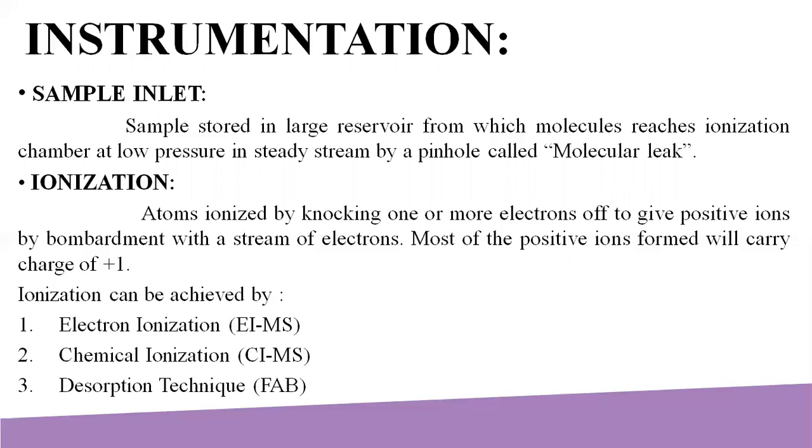The initial sample may be solid, liquid, or gas. The sample is vaporized into a gas and then ionized by the ion source, usually by losing an electron to become a cation. Even species that normally form anions are converted to cations, for example, halogens like chlorine and noble gases like argon.